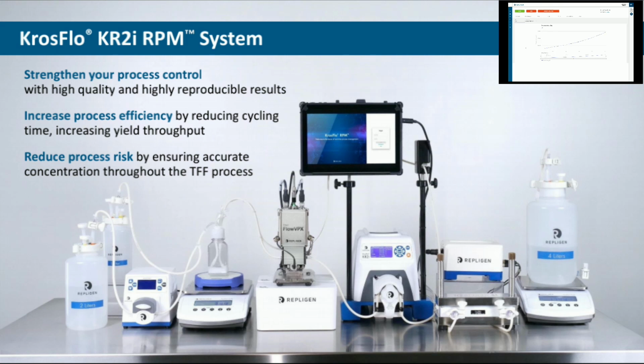So in conclusion, what I hope you will see in this live from the lab demo and at any other points in time with your interactions with the KR2i RPM system, is that this TFF system can strengthen your process controls, increase your efficiency, and reduce your risk through your TFF process. And this can really allow you to get from the bench all the way through to the manufacturing scale in a lot faster time and a more efficient manner.